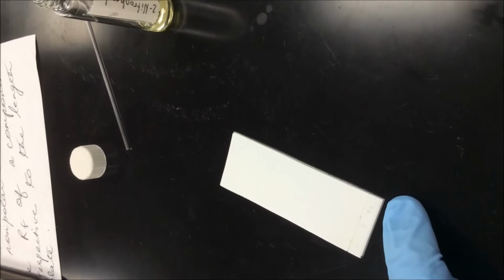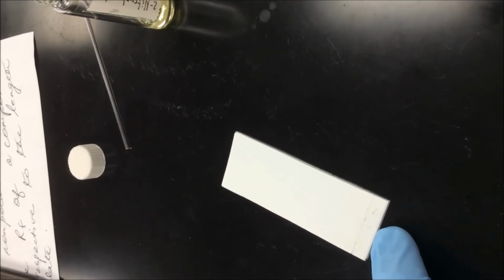Now realize, as you elute your sample, the samples are going to run at different speeds. One will travel faster than the other, and that has to do with the polarity of the structure. In the post lab, we'll talk about how, based on the structure, you can predict which one is polar or not. Again, recall spot number 1 was my ortho product, the co-spot was the combination of ortho and meta, and the second one was the meta by itself.